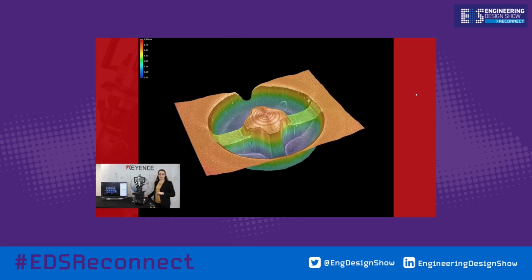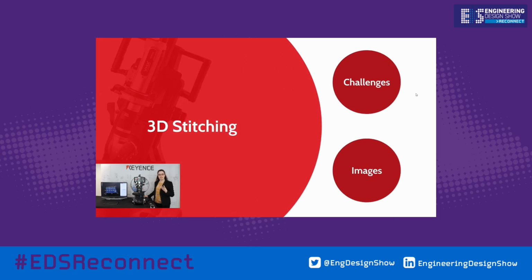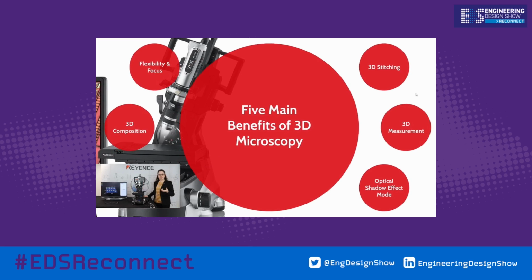And finally, we've got some kind of drilling tool that we've looked at to be able to see in full 3D. We've got the full stitch of every side of it. Right, so that's 3D stitching. And it's all well and good. These 3D models give us a really good idea of the shape of the sample. They give us an image of the sample. But if we want to, we can take it one step further and actually perform 3D measurement.